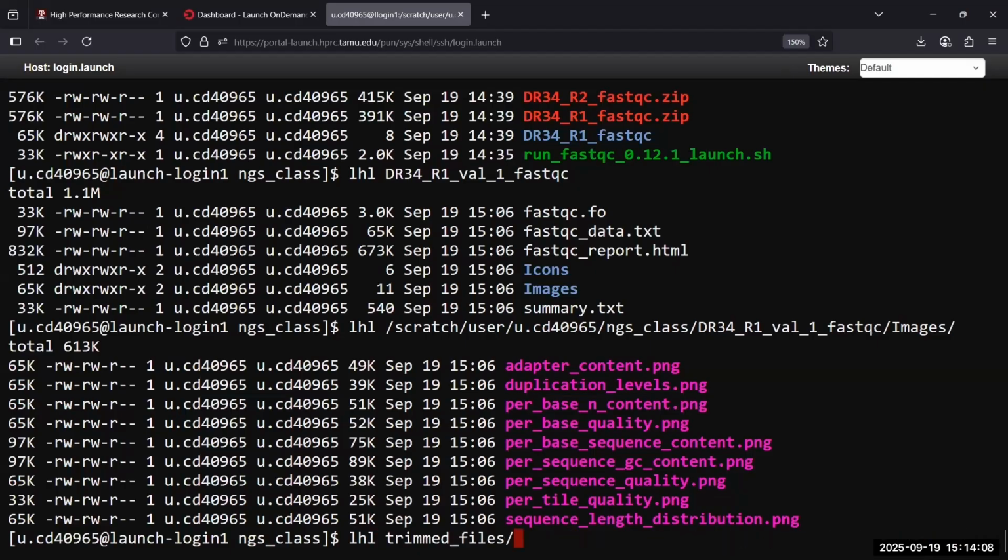Okay, so did everyone get that? First, you want to unzip. Did everyone get this unzipped? You going to unzip? Yeah. Okay. No. I'll see. Do ls. Enter. Oh, it's there. You did it.